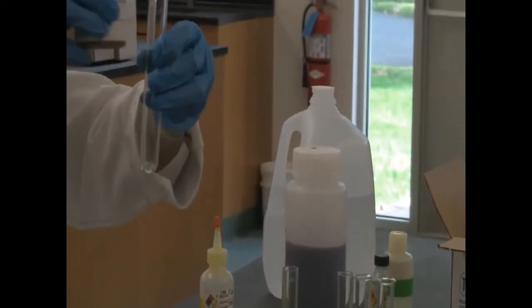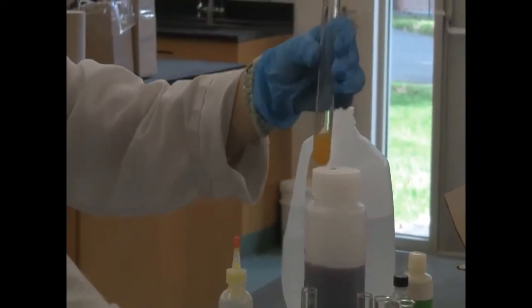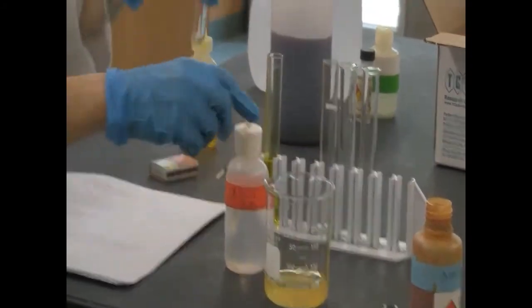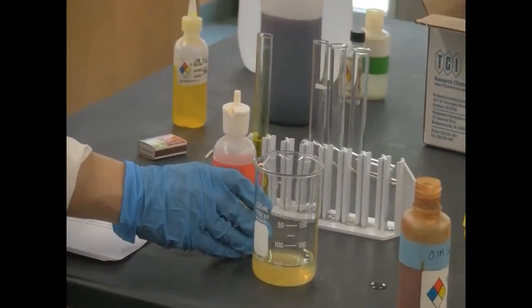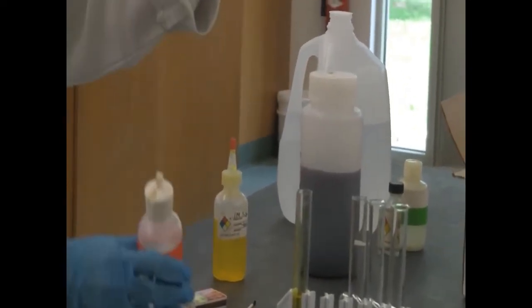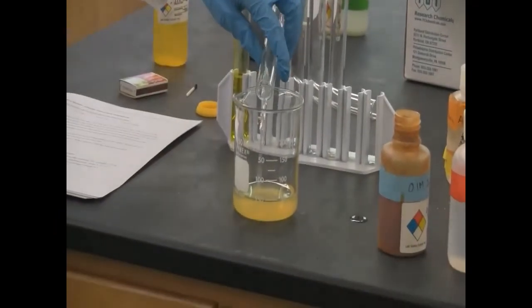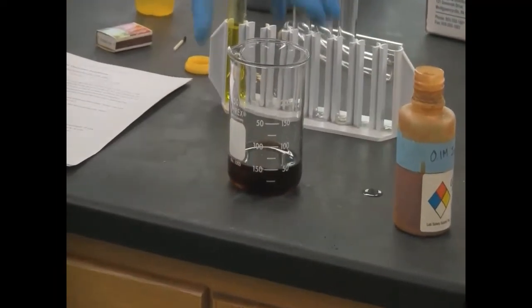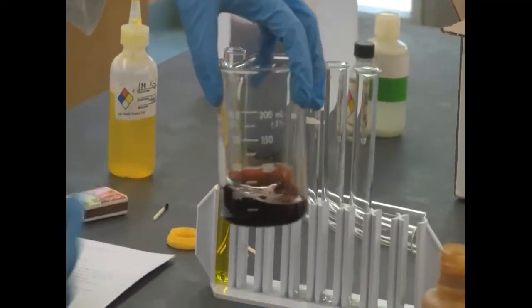Okay, so this is the iron 3 chloride. Check the color. Okay, so I'm going to dump that in here. So let's see the other one's color. Potassium thiocyanate. That color or colorless. Okay, in there. Now you can see this equilibrium is developed. That would be the color of the equilibrium right now with the amount of those added.